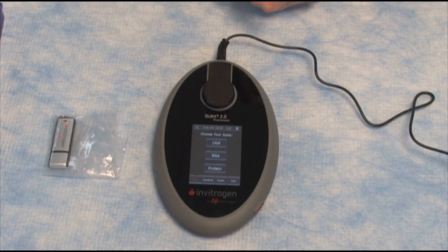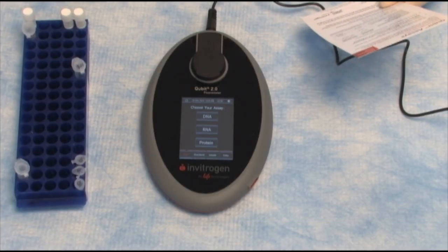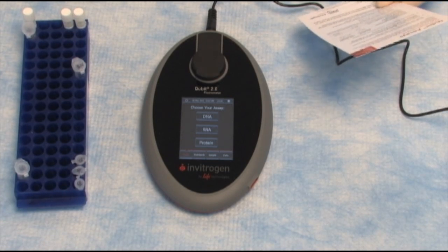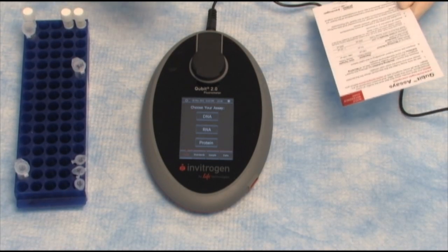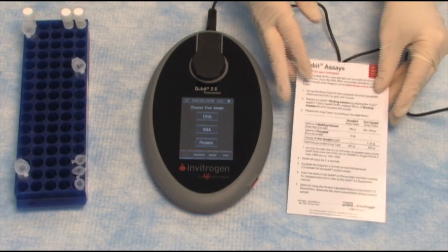Plug this in and plug in our Qubit. The Qubit will turn on and it will say that we can choose our assay: either DNA, RNA, or protein. Since we're working with RNA today, we created our RNA standards according to the instructions on the quick reference card, and they are in the recommended RNA reference ranges. Now we're going to start with reading our standards.